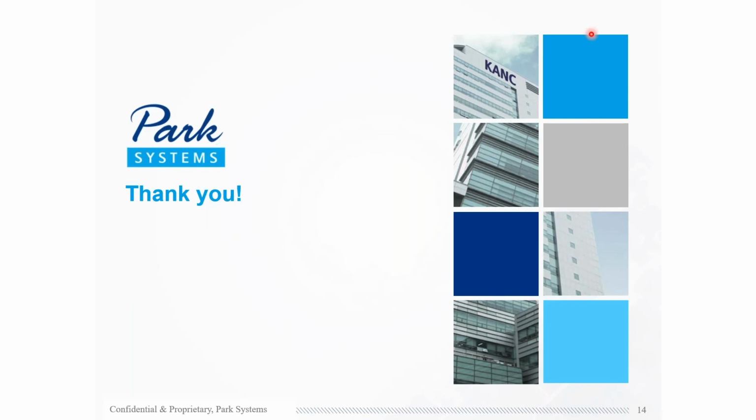Hi, everybody. I think we do have a question. I'm trying to see if I can read it here. So what is the Z height measurement range? And what's the max aspect ratio of the trench that can be imaged? So two questions, Matt. Understood.